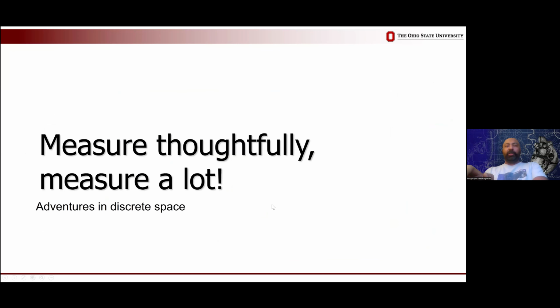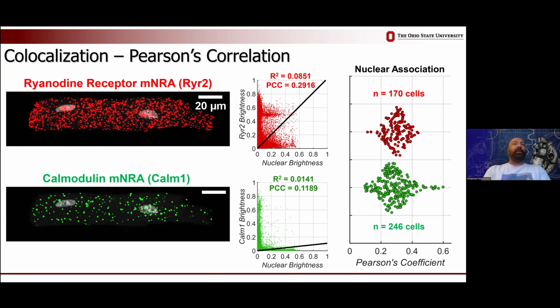So the first principle is measure thoughtfully and measure a lot. Simply measuring a lot doesn't always get you the best answers. Here's an example of a problem that a biologist collaborator came to us with. These are pictures from light microscopes of cardiac muscle cells or heart muscle cells. These are big brick-shaped things with 2 nuclei because they're so big.